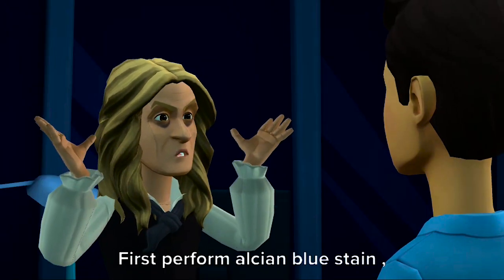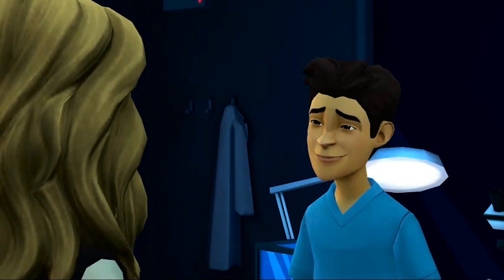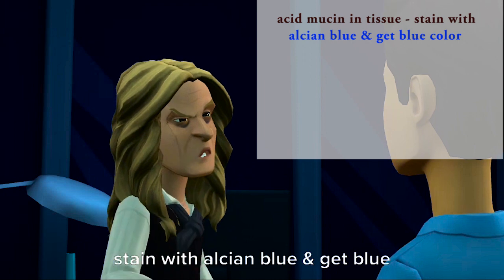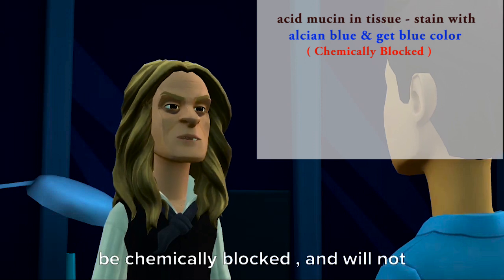First perform Alcian Blue Stain, and then perform the Periodic Acid-Schiff method. So all the acid mucin in the tissue stains with Alcian Blue and gets a blue color. Those remaining acidic mucins which are also P.A.S. positive will be chemically blocked and will not react further during the technique.